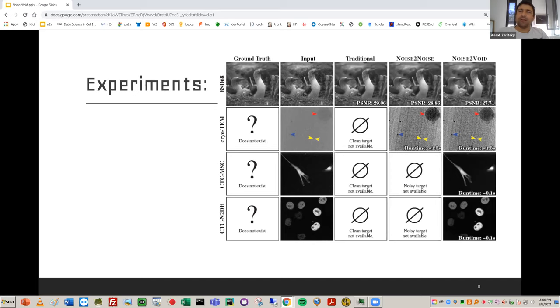There is a problem. First, like Samuel discussed, when you go to another microscope, you need to do the alignment, which is not trivial at all. So it's hard work first doing that. Second, what changes between microscopes is not only the noise. There are other things that change, for example the point spread function. Every microscope has different things that also change. So I don't think that this is the way to go.